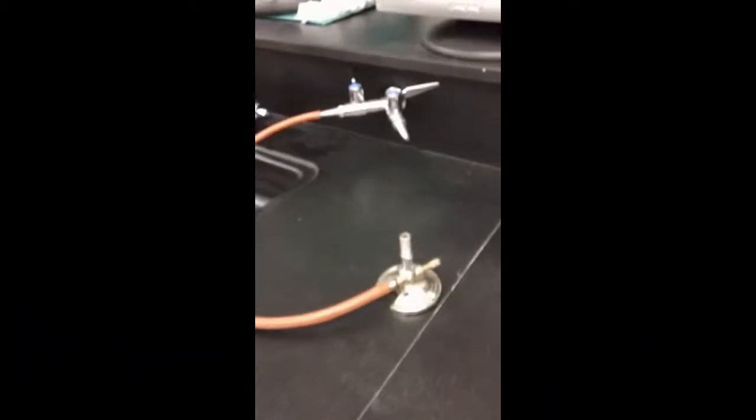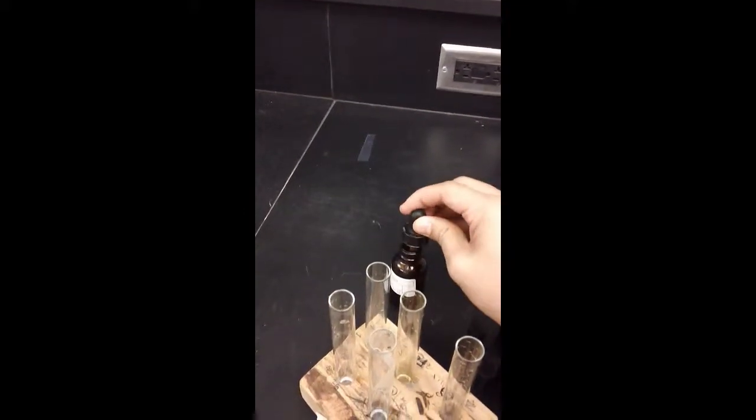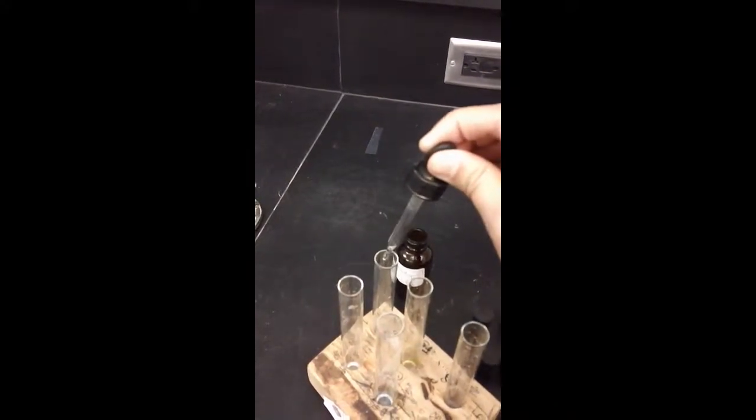I'm going to be performing my flame test now. According to the directions, I will have gone over here. I will add 1 or 2 drops of HCl, hydrochloric acid, to each of my test tubes. 1, 2, 1, 2.